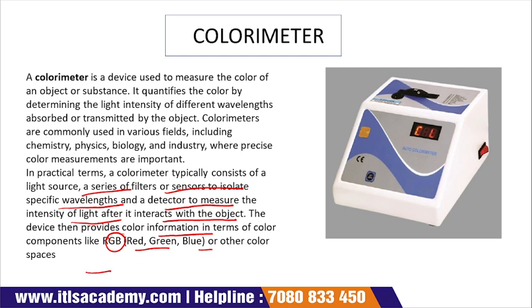See, this is your colorimeter. Here the wavelength ranges are mentioned. For example, if the wavelength of red is 58, as mentioned, then we set 58 here and put our sample in the colorimeter tube, and the display shows the reading. This is all about the colorimeter.